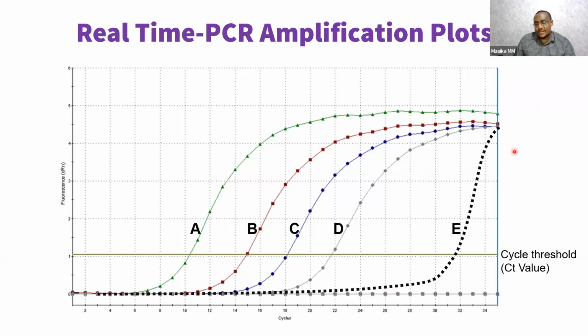This is PCR. It's better, of course, when you do it, but this allows you to understand it better as you read, and also to think through when you're reading patient results and look for what genes they were targeting. It's not just SARS-CoV-2. You might see that they were targeting this gene or the other gene. How do you interpret those results?